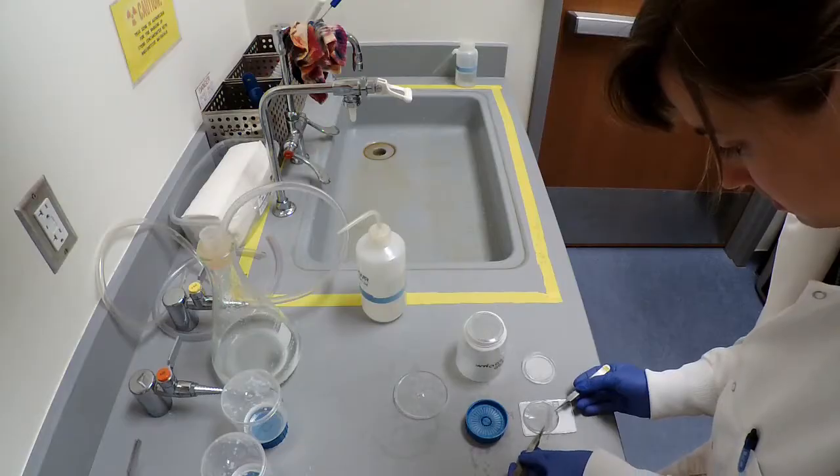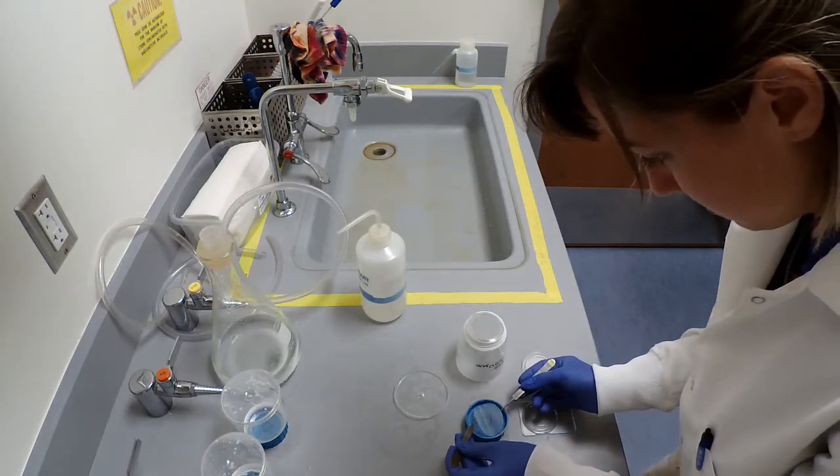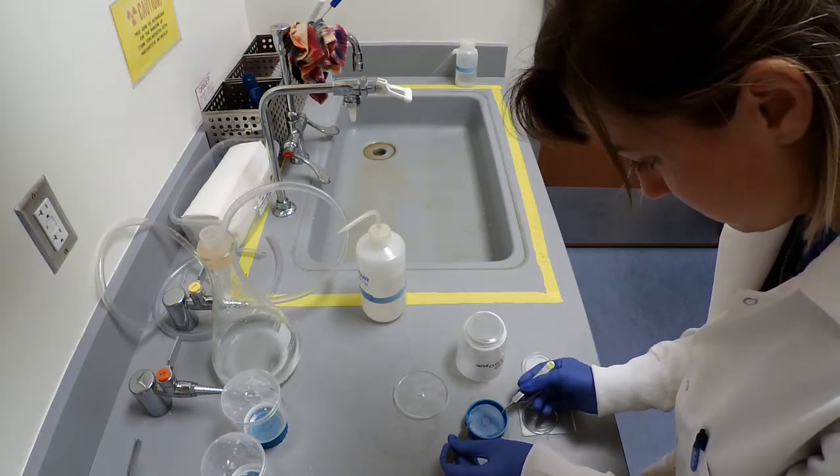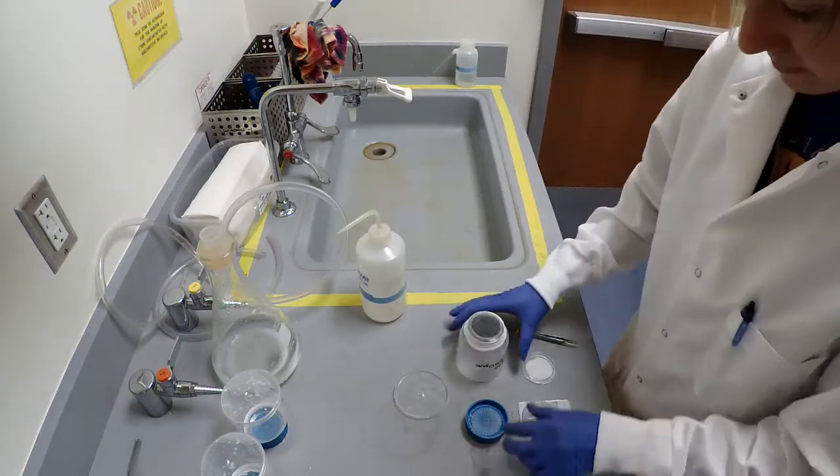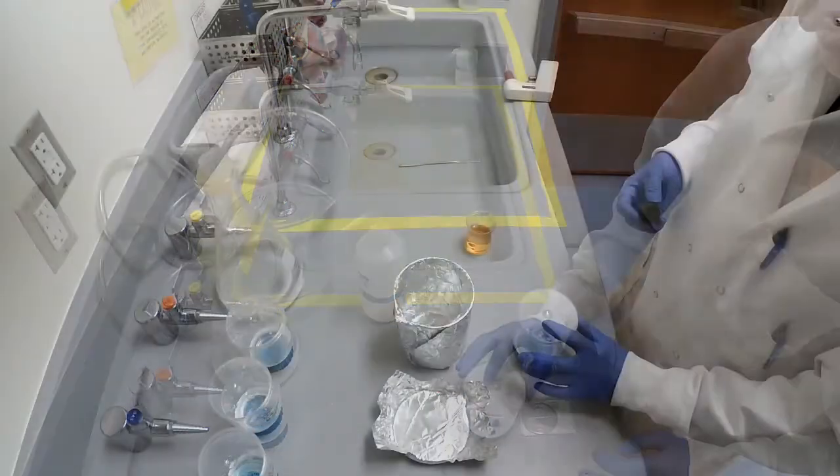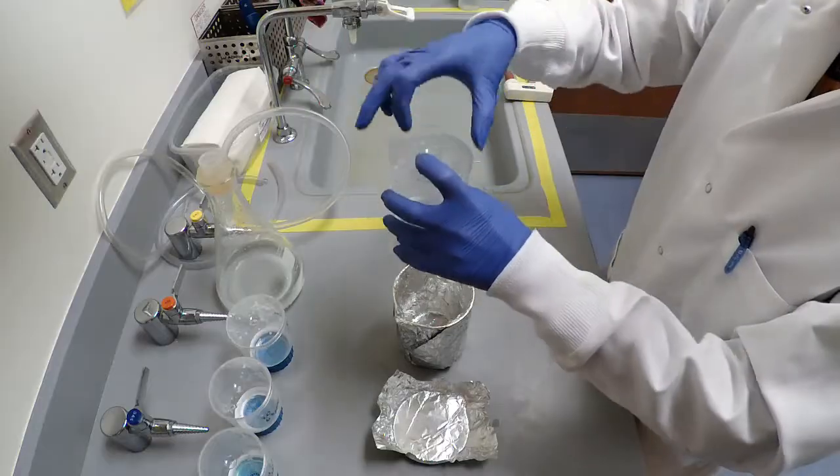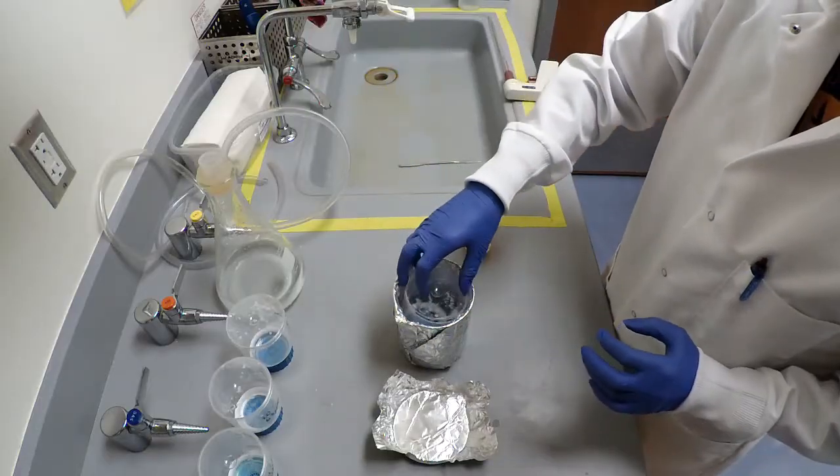For Nile red staining, place the filter back onto the filtering unit. Plug the filtering unit with a rubber stopper and place into a foil lined secondary container.